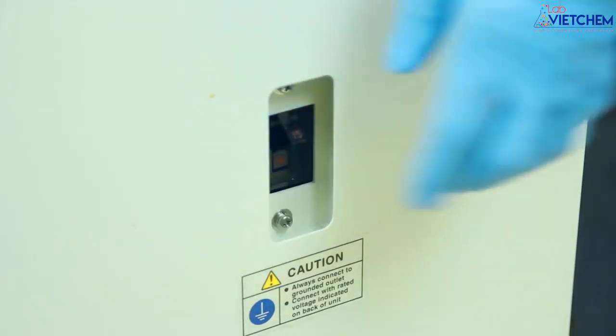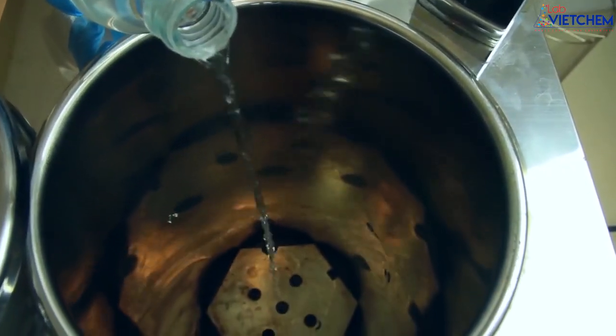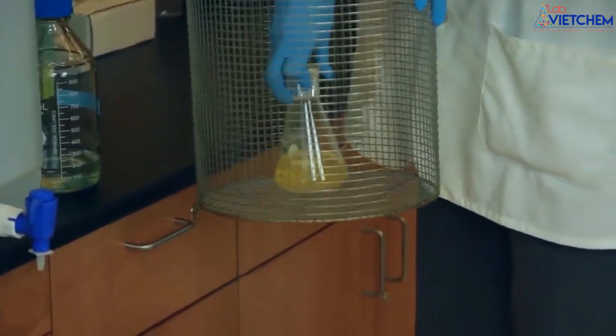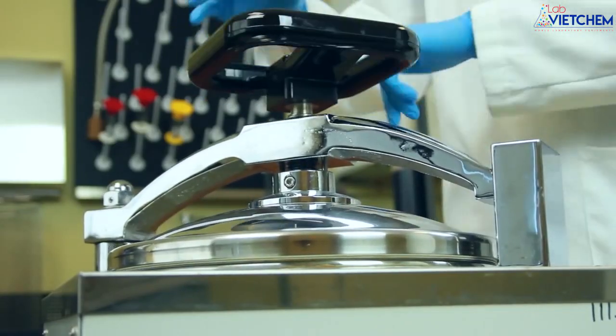Turn on the power and make sure the drain valve is closed. Add deionized water to the level indicator line. Place the flask of culture media into the basket. Insert the basket, close the lid, and turn the handle to create an airtight seal.